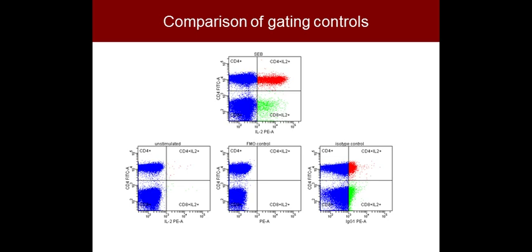All right. So I probably don't need to say anything more about that, but just in case some of you are still devoted fans of isotype controls, I will make the point with one more sentence, which is to say that this old concept of doing individual tubes with one isotype-specific antibody as a control is really pretty worthless.